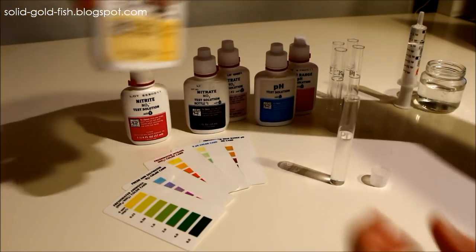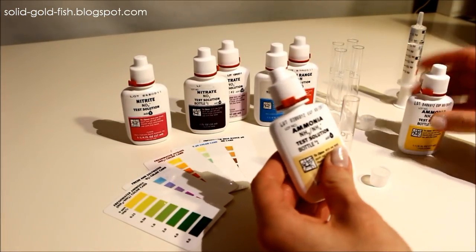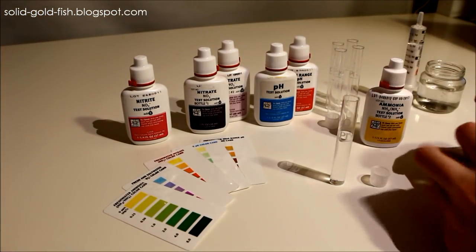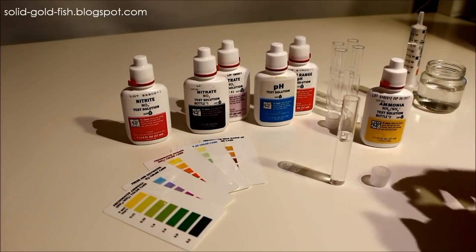The ammonia test has two bottles. You use bottle one first and then bottle two, and you add eight drops of each one.